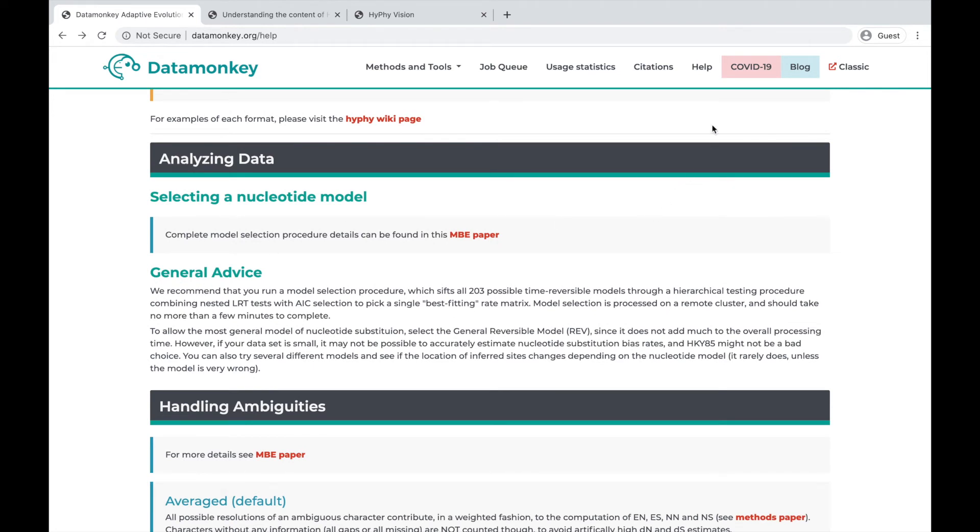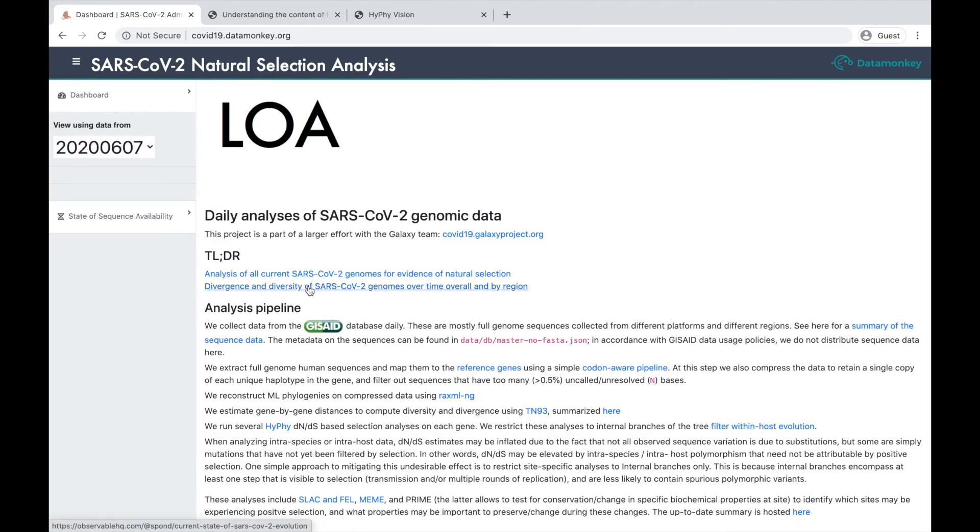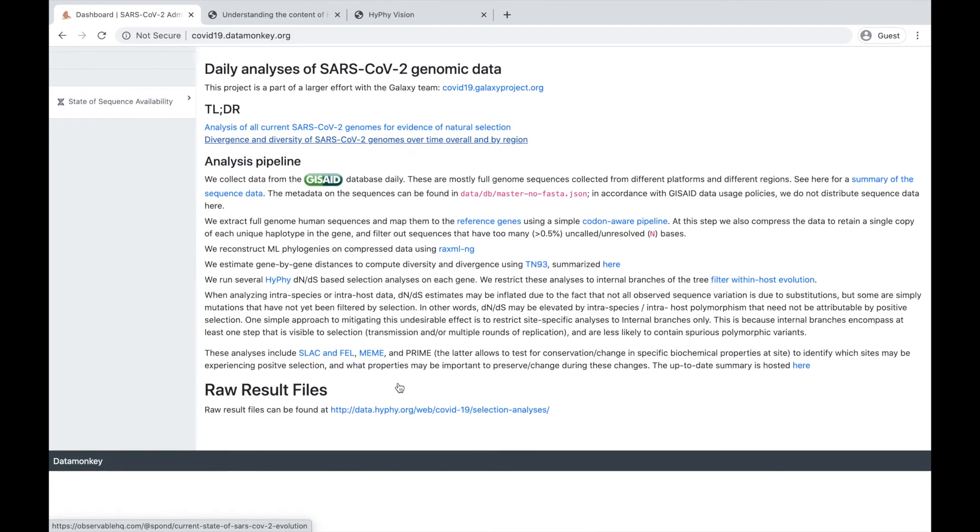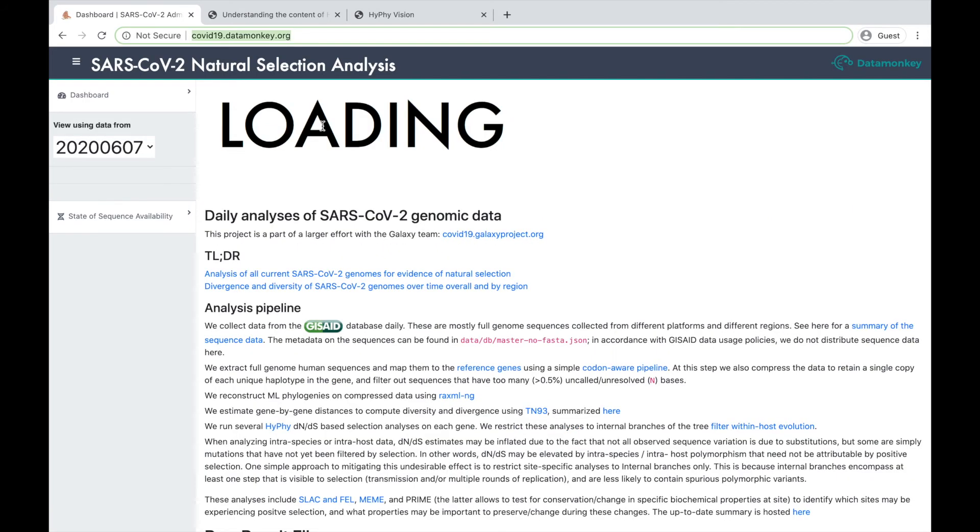If you're interested in our work on COVID-19, we also have a link to that dashboard available as well. This dashboard is updated daily with new sequences.